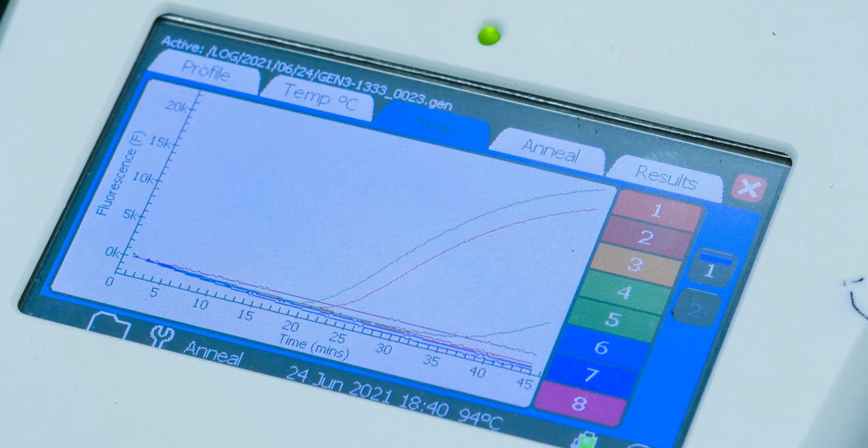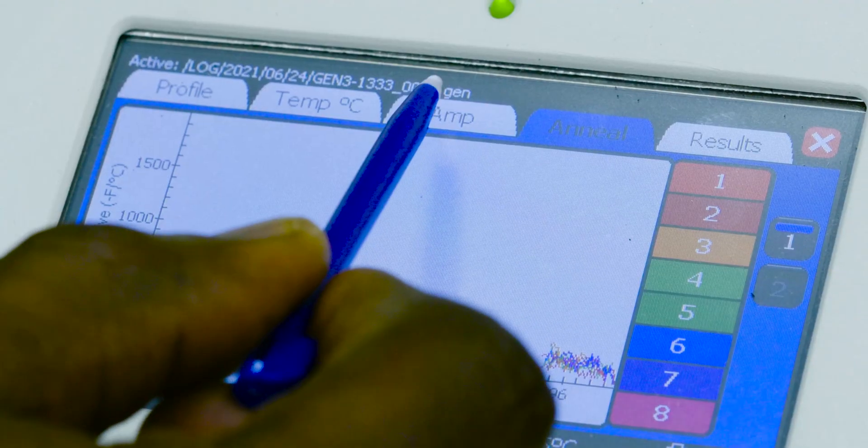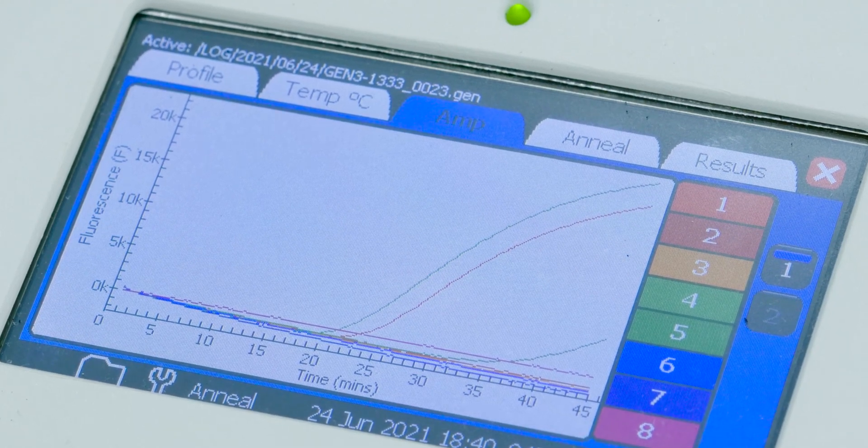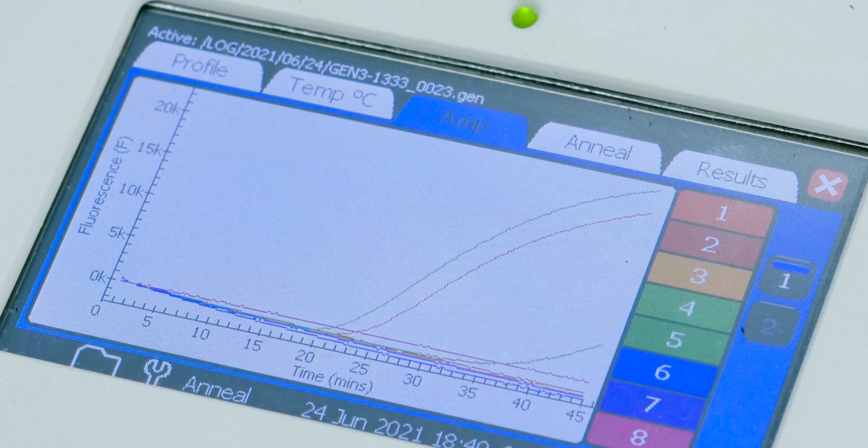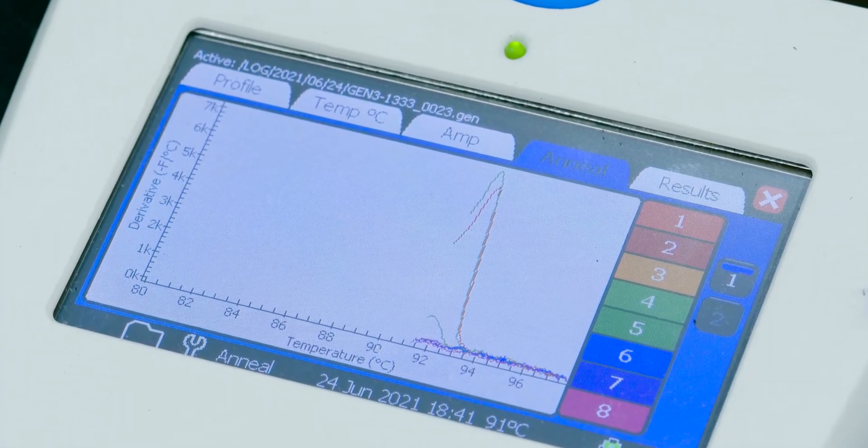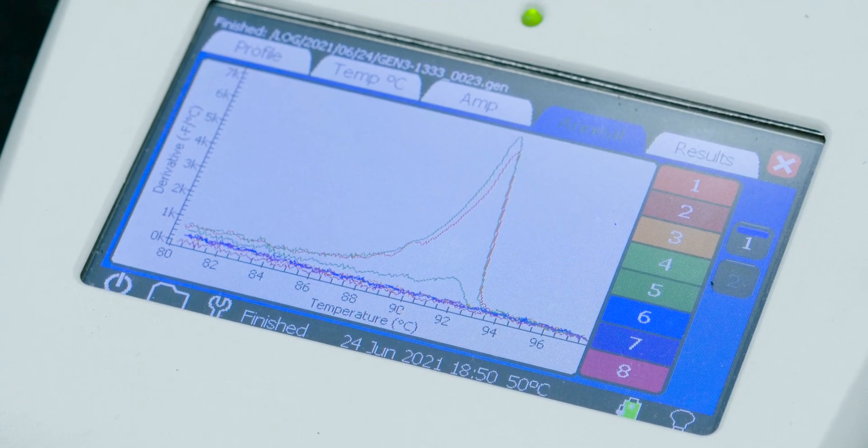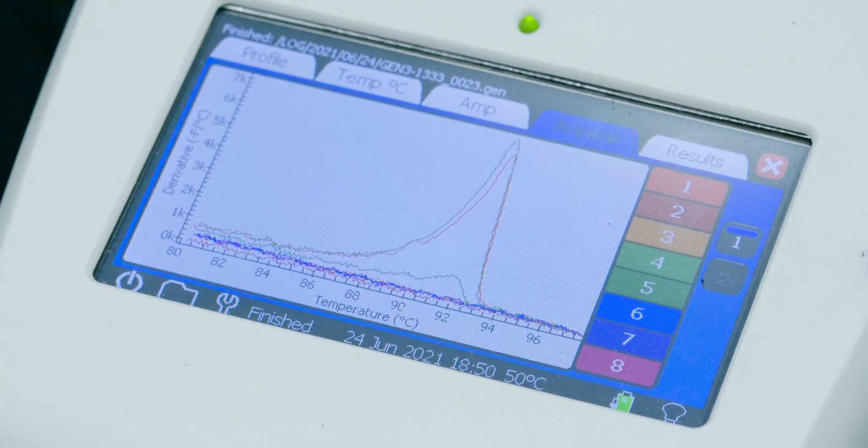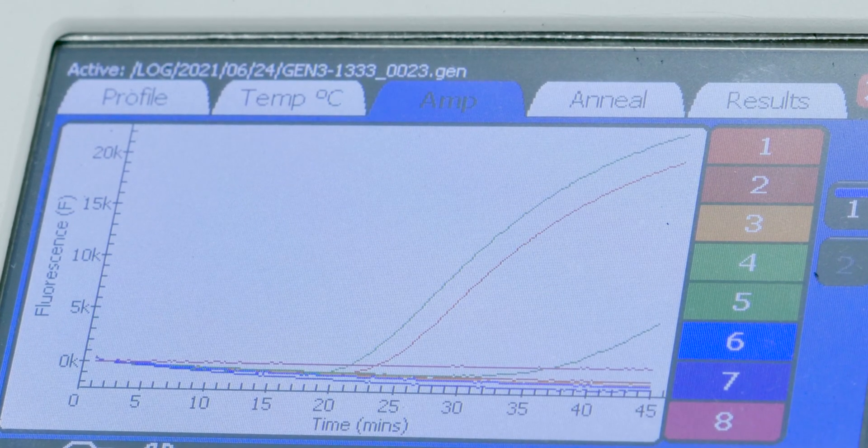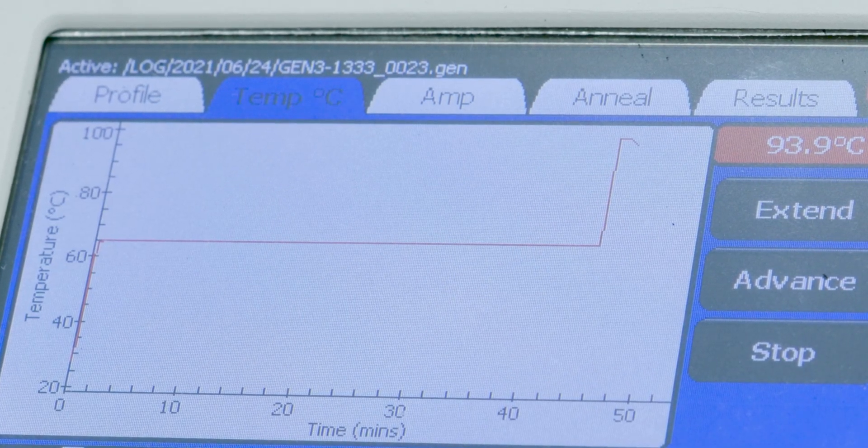The fluorescent signal should have a typical S-shaped sigmoid curve as the fluorescence will first increase slowly, then exponentially, and then slowly again, which plots a curve that resembles an S. The anneal derivative should be about 86.7 degrees Celsius from alkaline PEG extraction and 89.6 degrees Celsius from boiled extract. Alkaline PEG is preferred in field conditions since it lowers the melting temperature, which is favorable because the Genie machine is battery-operated.